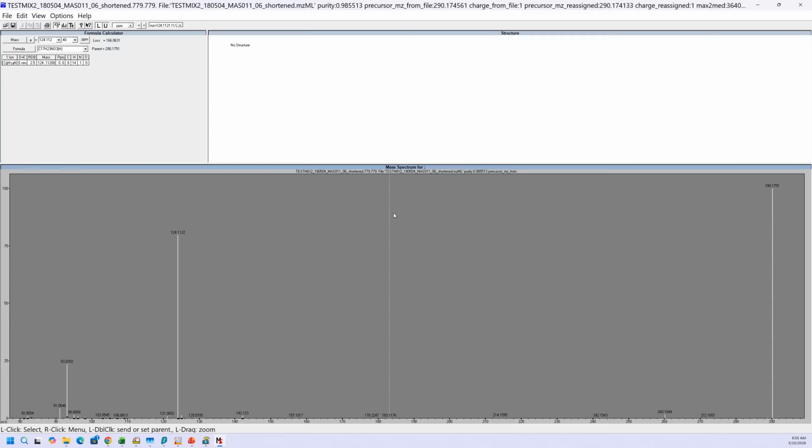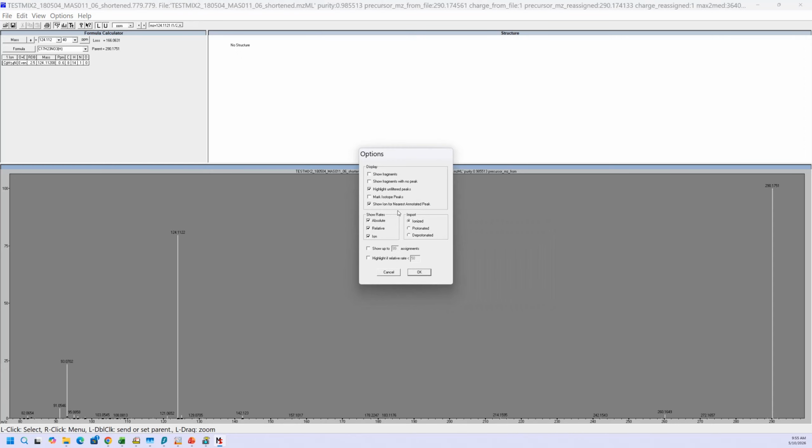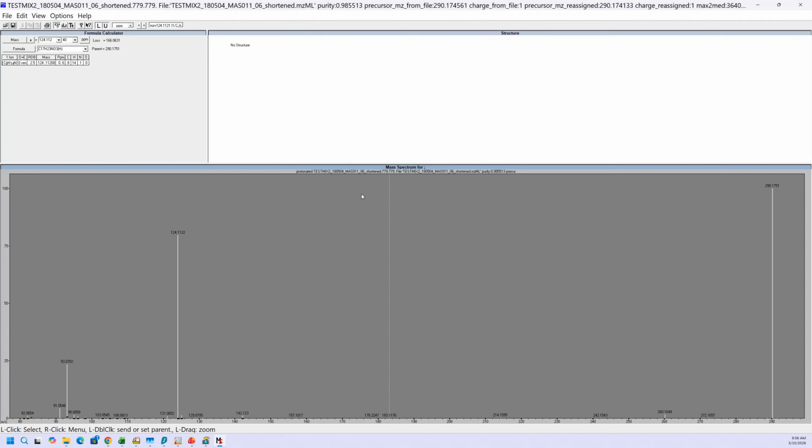And also, when it comes over here, you need to make sure when you're using this window to go to Options. The other two came over as automatically being protonated in the options, but that's not the case here. So if you want to use this and compare it to a structure that you'll paste in here, I'll show you how to paste a structure in later in another part of the program, and say OK. Now when you bring it in, it'll work properly. If not, if it's ionized, that's in the EI mode and the fragmentation model will not fit your MS-MS data.